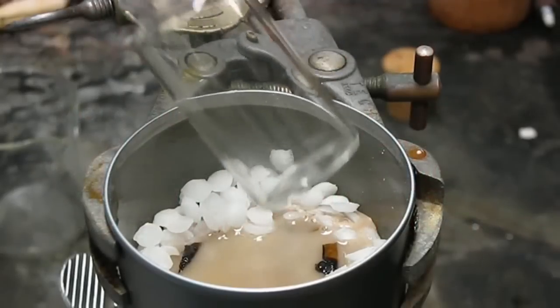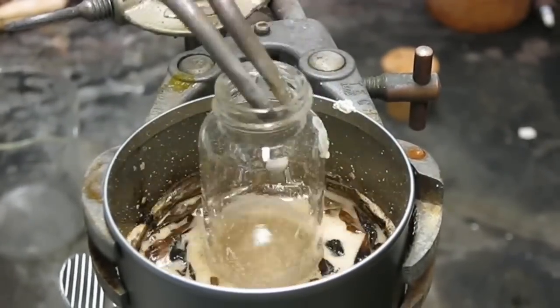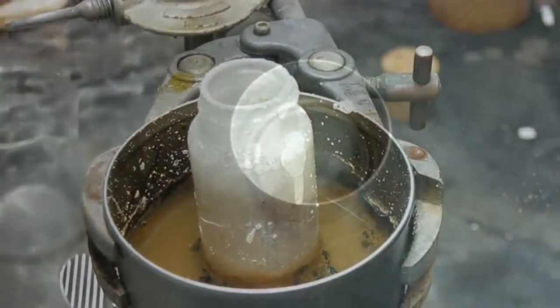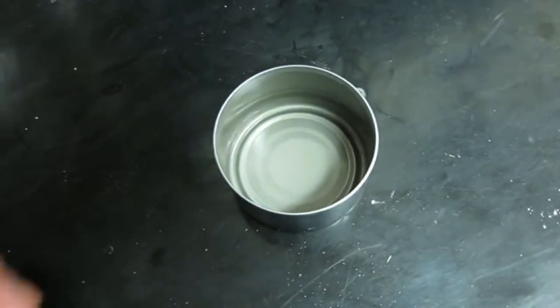Greetings fellow nerds. By special request, we're going to dissolve glass using sodium hydroxide, better known as solid drain cleaner. Since we can't do the experiment in a glass container, we're going to use the steel tin.